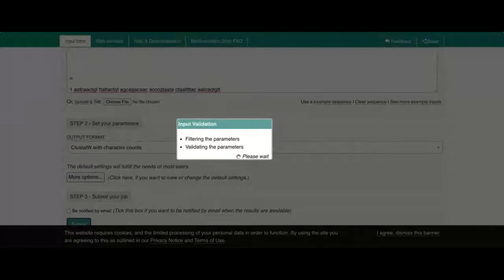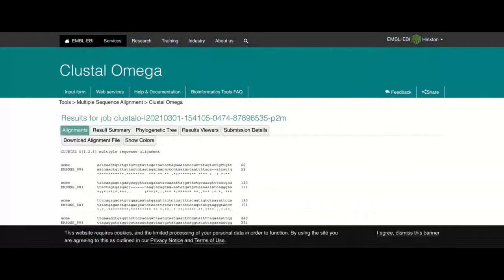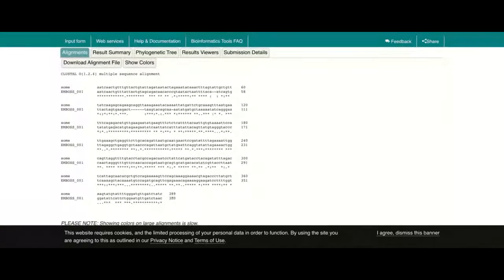So I'm doing the wrong way, just to show you. Oh, we did not notice, it thinks it's aligning protein. And okay, there is a bunch of matches, mostly because I didn't put a third sequence. So it's easier for 2 things to agree than for 3 things to agree. So here, this is the first word of my description, and then this is the code the computer decided to give when I didn't give it a name.